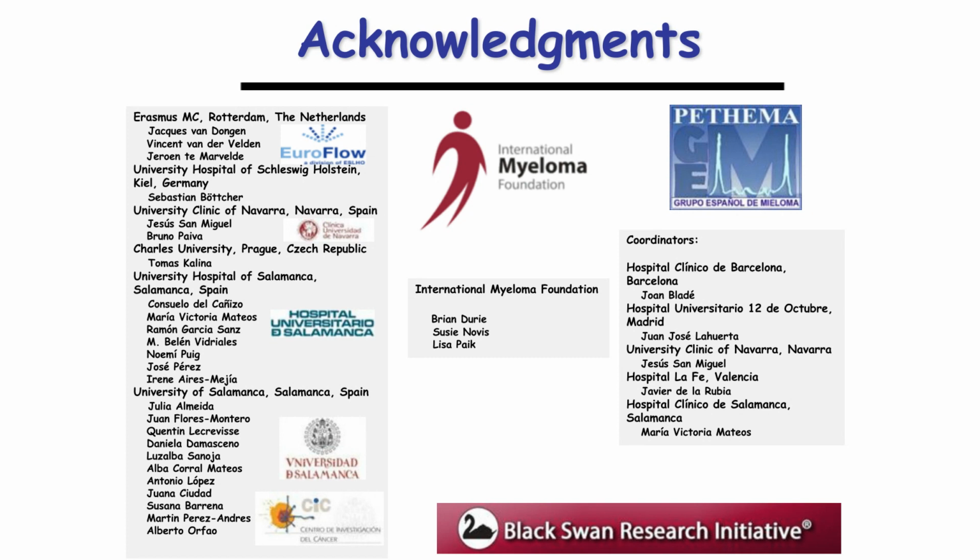Only if the sample is not being evaluated for follow-up, or just for diagnosis, then we go for a less sensitive panel, meaning the diagnostic classification panel. So the key decision would be triggered uniquely by the information that these patients have been treated in advance.